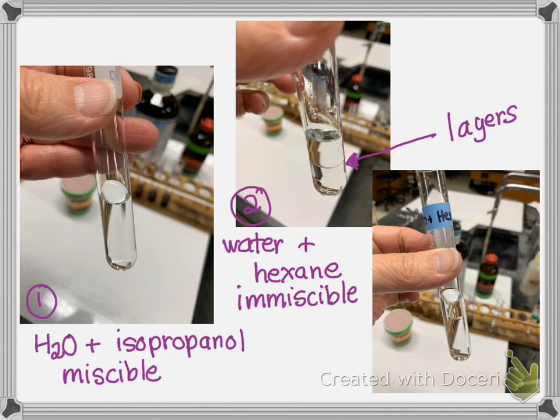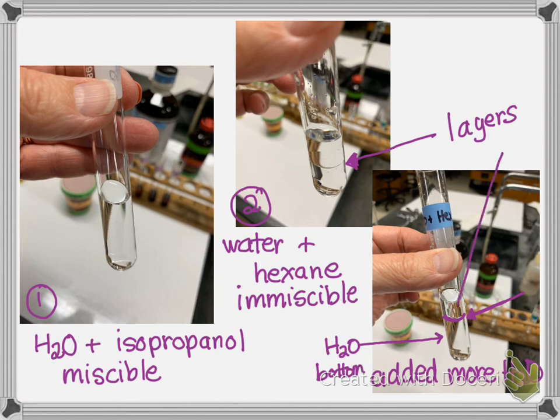Now, one of the questions says, well, what is what? So I added more water to this picture. And if you look, right there is the layer. So which layer got bigger? The bottom layer or the top layer? So I would say this one got bigger. And so if I added water and the bottom layer got bigger, that would mean water is on the bottom because it got bigger. And then hexane is on the top.